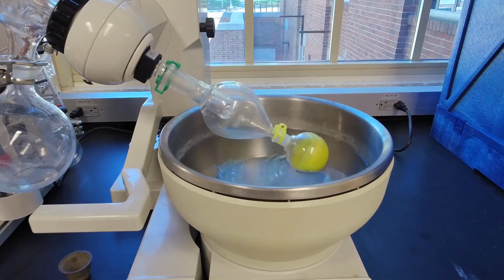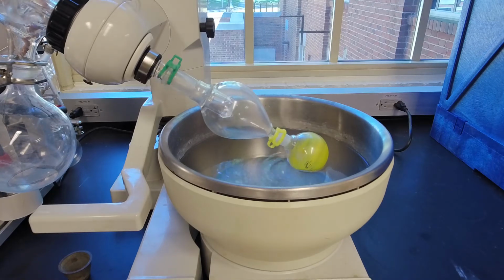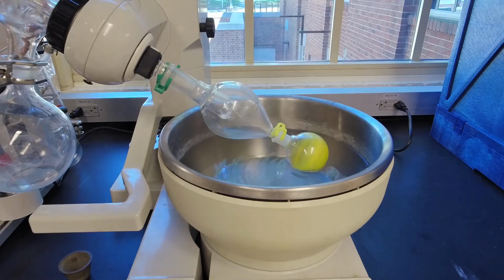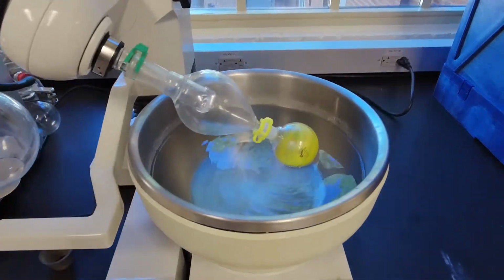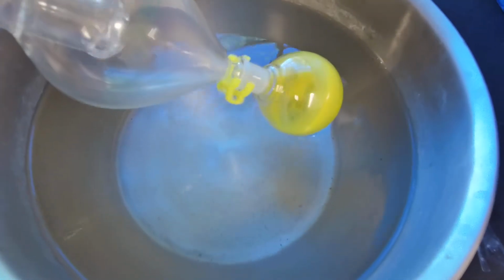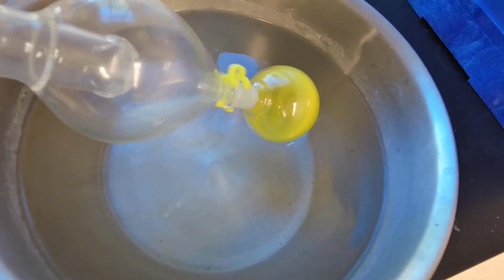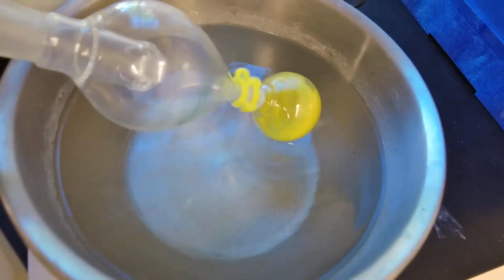Now, are we done? What I would recommend, certainly in a research lab, is this: it looks like we're done. If you look at this really closely, got to make sure I don't drop my microphone in the water, right? That looks like there is no more solvent in there. There almost certainly is.